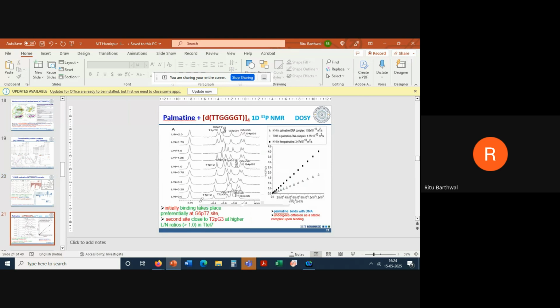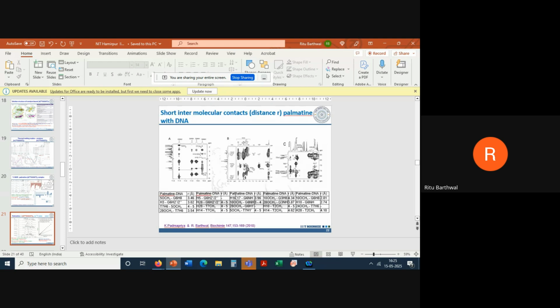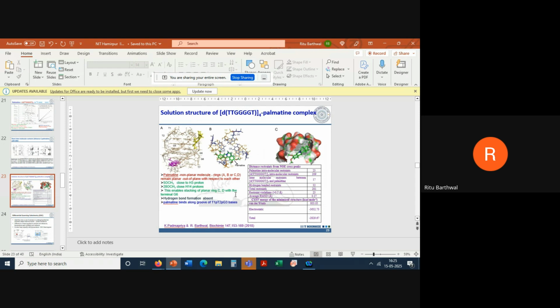So in different complexes we can do phosphorus NMR. Phosphorus NMR clearly, one line will shift a lot. This is well known from theory, if intercalation takes place, and that is why we do phosphorus NMR. We did not get shifts in this case, which means for these ligands of ours, we were not getting intercalation, they were binding from outside only. So that is another complexation that is done.